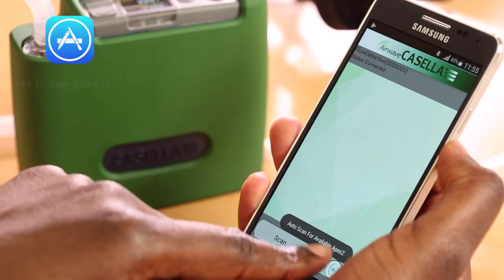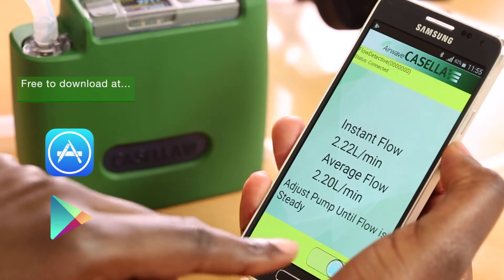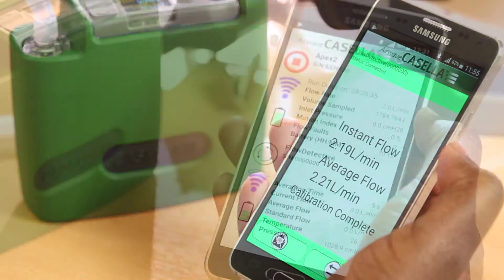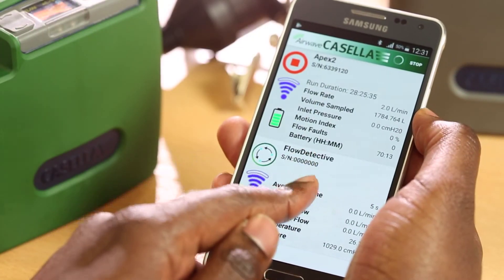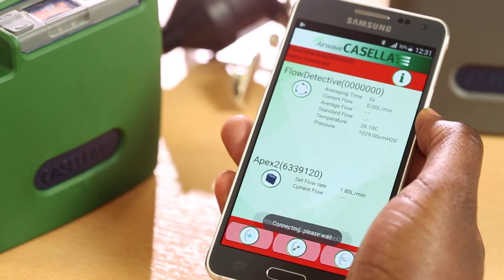When calibrating any pump, the Airwave app can wirelessly retrieve the calibration information from the Flow Detective. When used with the Apex 2 pump, the Flow Detective can connect as well, allowing all calibration settings to be done from the Airwave app.